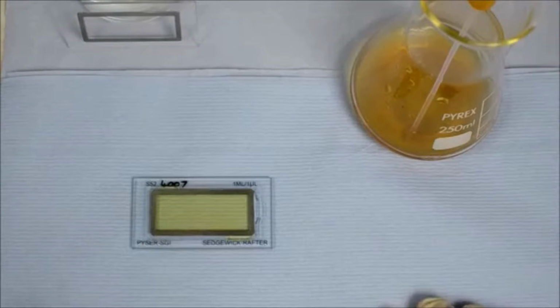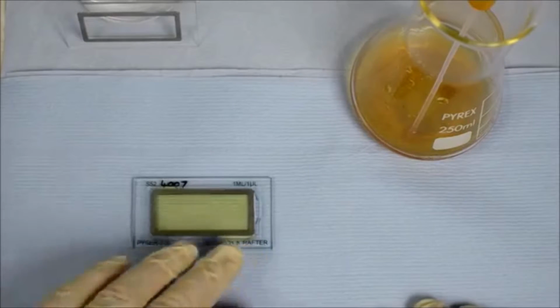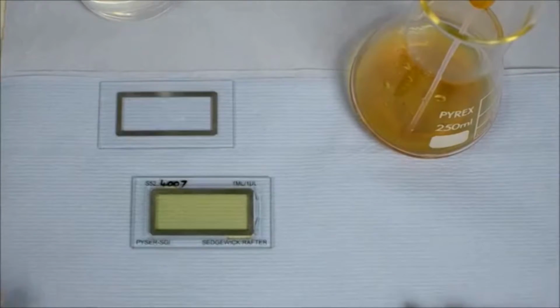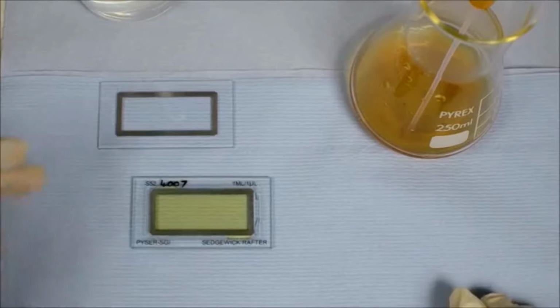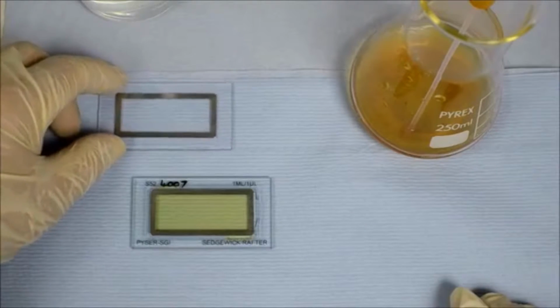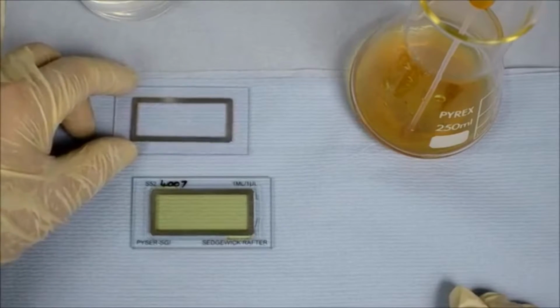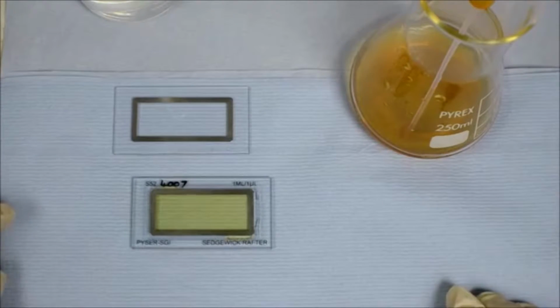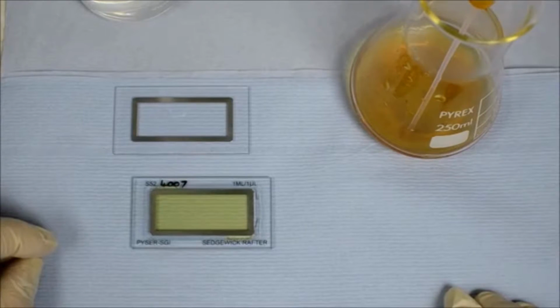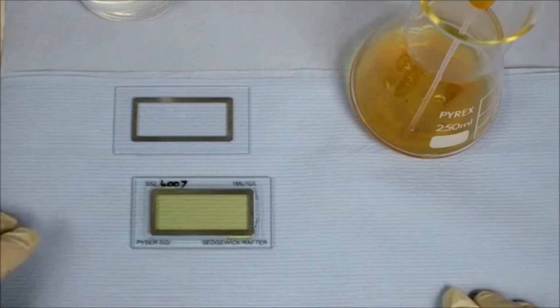Now, the base of the Sedgewick Rafter can be plain or gridded. This is a gridded model, and this one here is a plain base model. Now, Pyser manufacture both types. The clear base version is intended for use with a Whipple grid or an index grid in the eyepiece of the microscope. The view of the chamber is moved, and random locations and counts of the subject are taken using the eyepiece grid as a guide. Now, this method does require you to know what magnification you're operating at, so you can actually calculate the volume of the area covered by the grid and in the reticule.